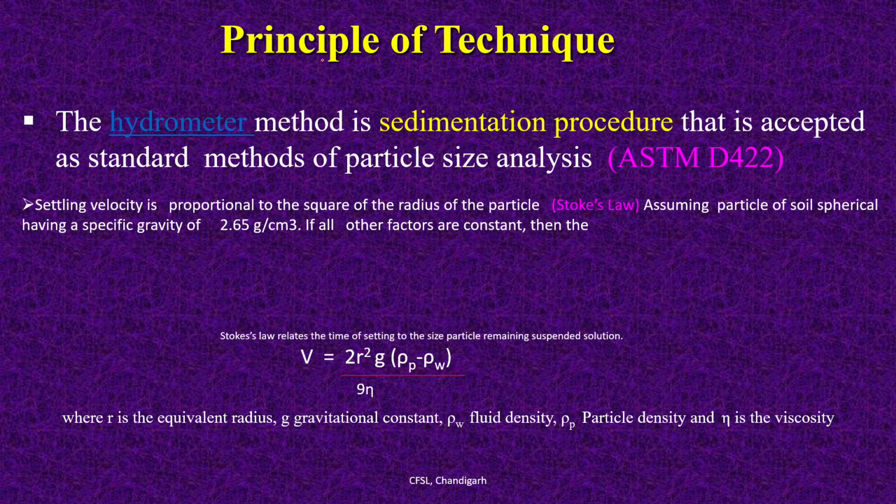However, I have tried to summarize the procedure for particle size analysis for comparison of soil samples, so you can get some idea, read further if you require, and apply this technique in real cases.